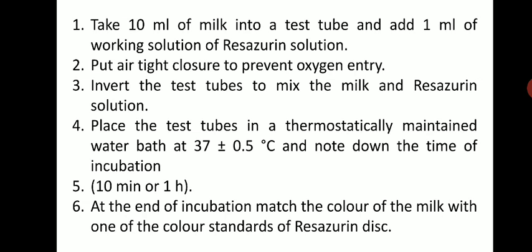It is kept for 10 minutes to 1 hour, and at the end of incubation, match the color of the milk with the standard Resazurin disc. So you add this dye to milk, keep the entire solution at a fixed temperature in a water bath maintained at 37 degrees Celsius, and at the end of incubation you observe the color change and compare it with the standard Resazurin disc or some other colored standards.